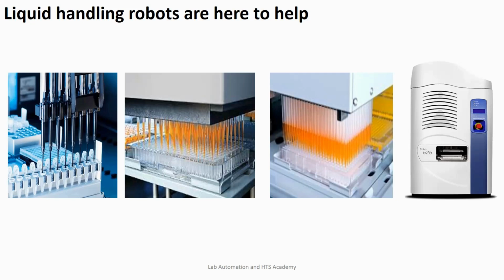So you can see that it is very powerful. You can do lots of things. And of course, it comes with a limitation. For example, when you're using a 96 well head, you cannot control each single channel. All of them are going to transfer the same amount of volume at the same time. So that power comes with compromising the flexibility a little bit. But for most routine cases, when we are transferring liquid, that is exactly what we want. We just want to transfer liquid from one location to another.